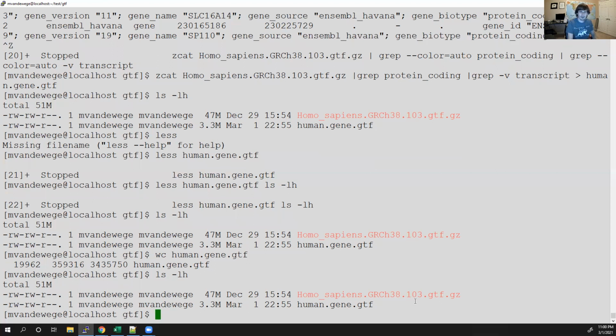Yeah, so what we've done today is, I guess, our 3 commands: zcat that we've learned, we learned the pipe special character, we learned grep -v and word count. And so that's probably enough. Whenever we have these massive files and we don't know how to code, just knowing a couple of unique tricks can help us filter files out pretty easily. So yeah, I'll leave it at that.